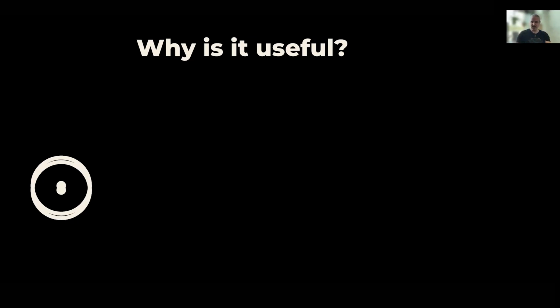So this is the big resolution problem that we are dealing with in light microscopy. And this has been described already in the 1800s by Ernst Abbe. Your resolution, the distance that 2 points can be resolved at, is just defined by the wavelength divided by 2 times the numerical aperture of your objective.